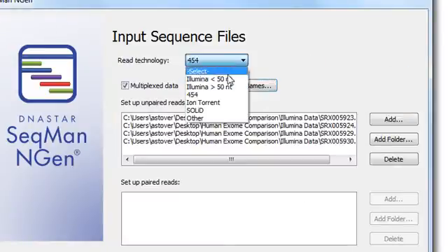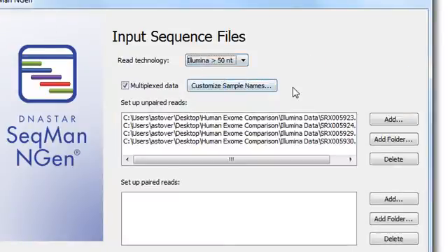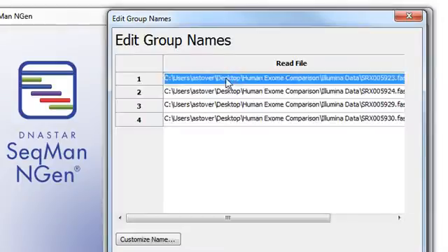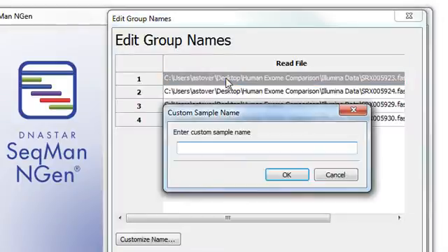For Illumina data, read files are typically already separated out by sample, so all you need to do after selecting the multiplexed option is to name each sample.